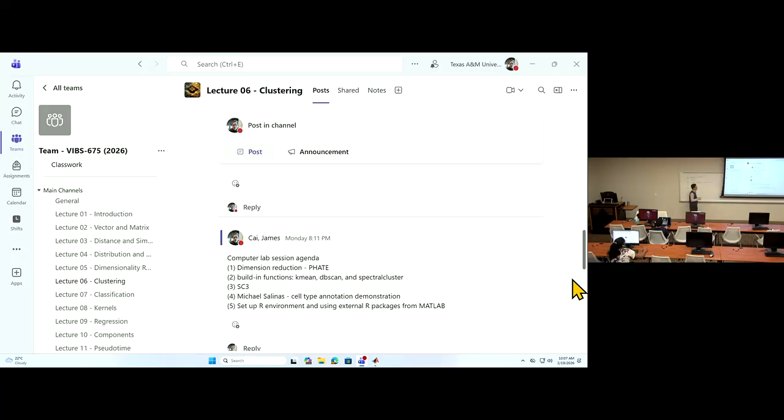At the end, you will realize there are functions in the toolbox you can use to call R. There's a built-in bridge that allows you to call R directly from the toolbox. I will show you how to set it up. Then you can utilize some of the functions in R. We don't always spend the time to re-implement those algorithms because R already has a very mature single-cell data analysis environment, so some of the functions we will want to borrow directly.